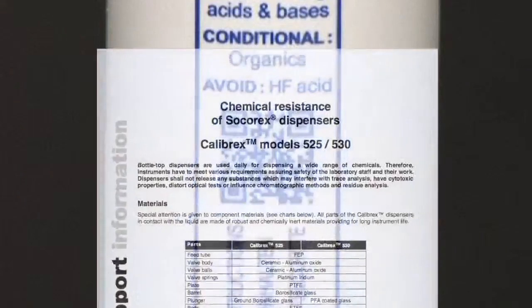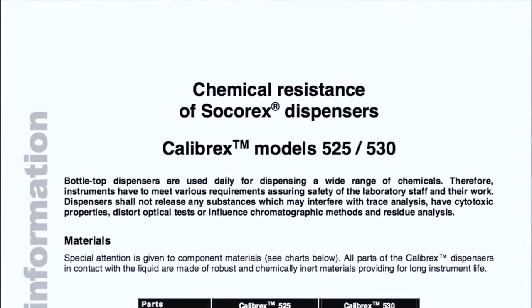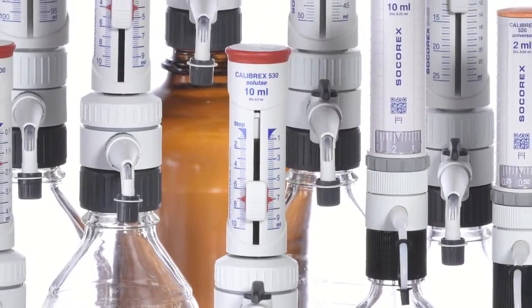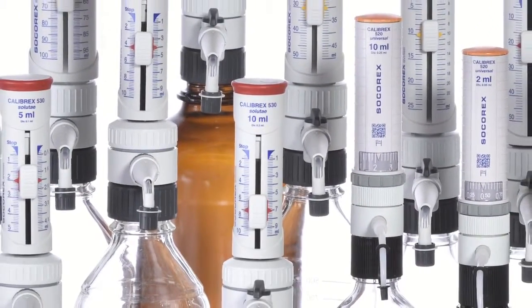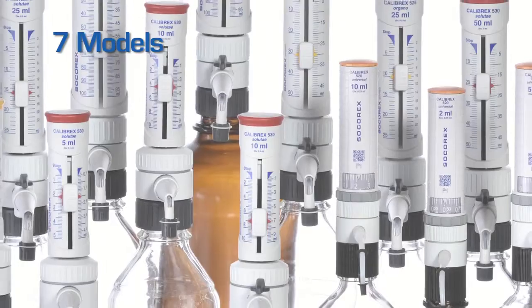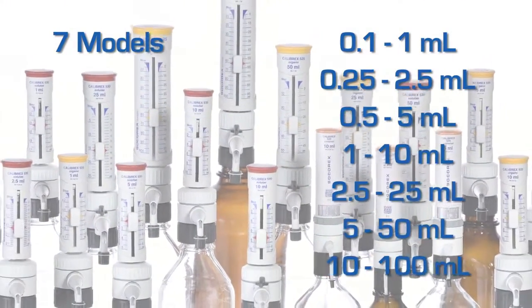Both Calibrex Dispensers exhibit excellent chemical resistance and come with a QR code that enables instant access to a chemical compatibility chart. Both the Calibrex Organo 525 and Salute A530 are available in 7 volume ranges from 0.1 milliliters to 100 milliliters.